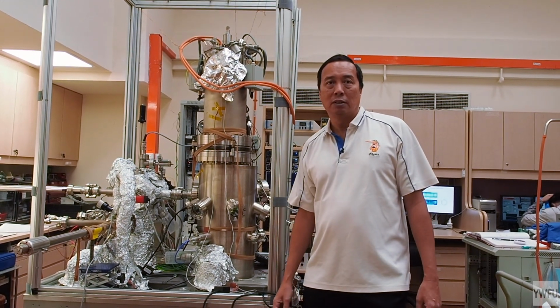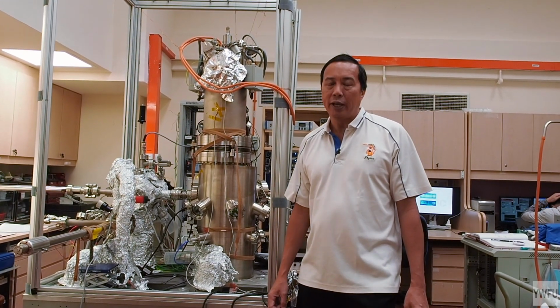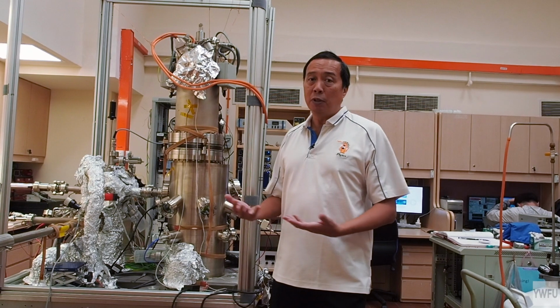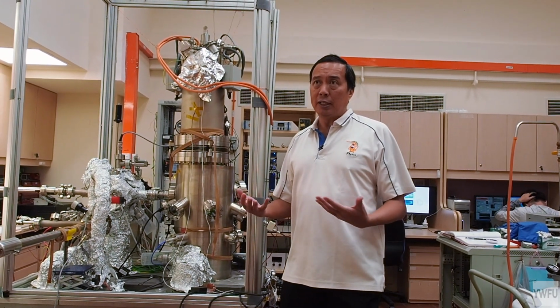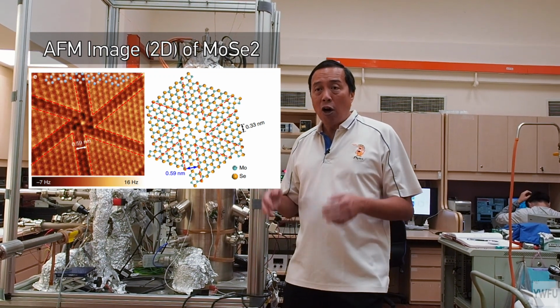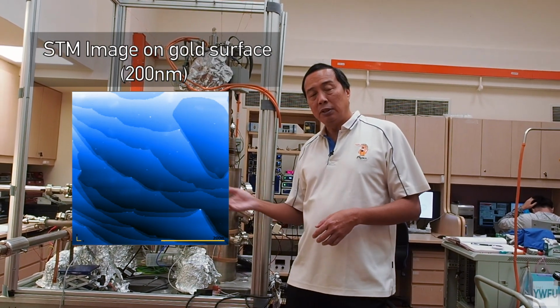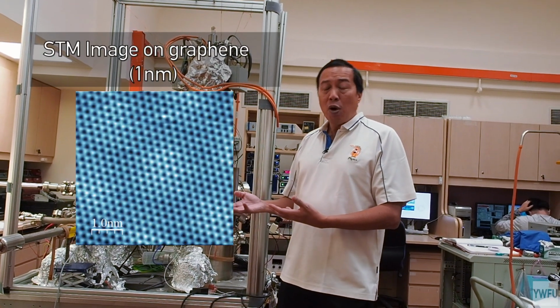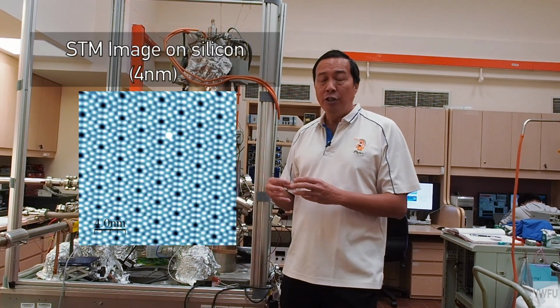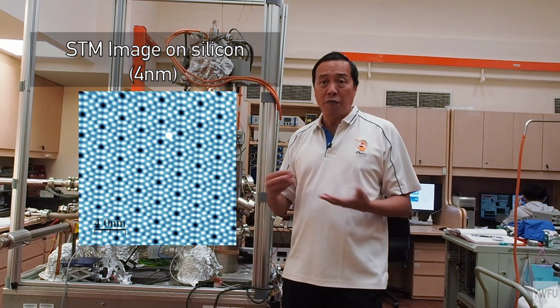So what type of research or real application do scientists use on this machine? Okay. The STM and AFM can image any material. I just showed an example of a molecule. So if you're researching different types of materials, superconductors, two-dimensional materials, and you want to understand how the materials work at the atomic scale, these are techniques you can use. For example, in the molecules we showed you, nowadays people are trying to use these molecules for electronics in a field called molecular electronics. In the future, you might see devices that work just on a few molecules.